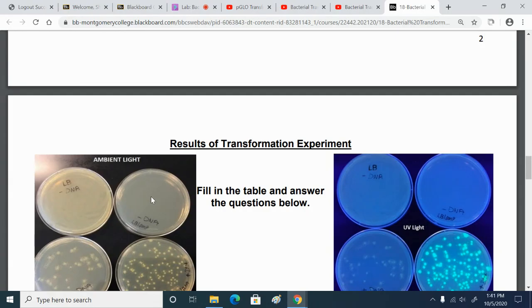That the E. coli that the AMP kills the E. coli. Right, so ampicillin kills E. coli. Or in other words, the E. coli are susceptible. In other words, E. coli are not already resistant to ampicillin. So we need to know that.